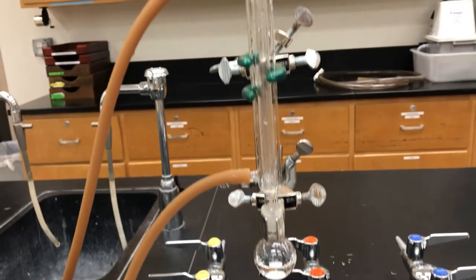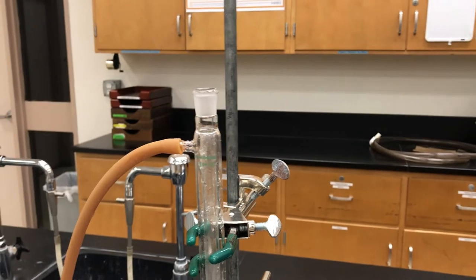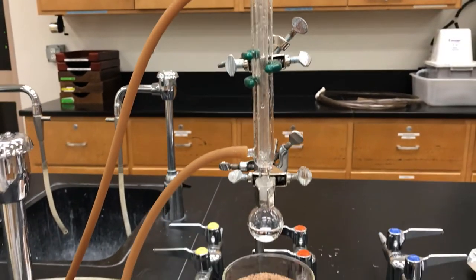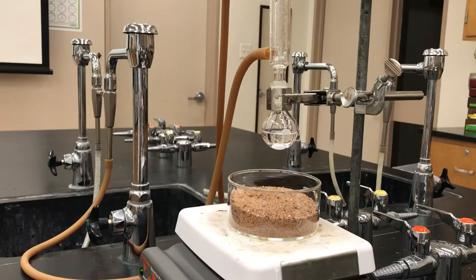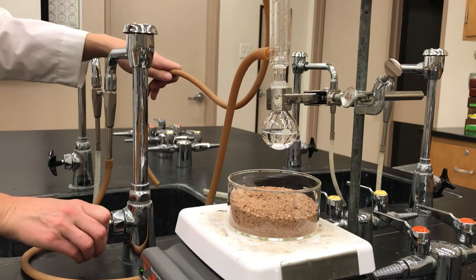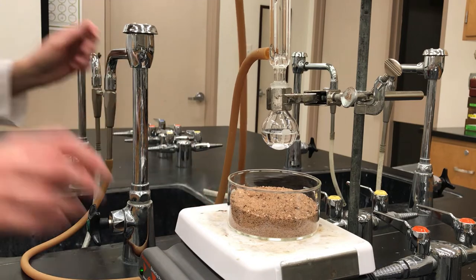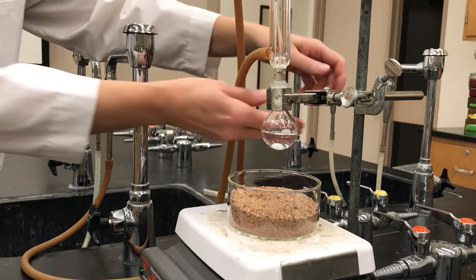It's a flask with a condenser attached to it. On the top, you don't want to attach anything. Don't put a stopper there, just leave it open to the atmosphere. Once you're ready to start heating, then turn on the faucet and get water flowing through the hoses and through the condenser. Then turn on the stirring mechanism if you're doing that.